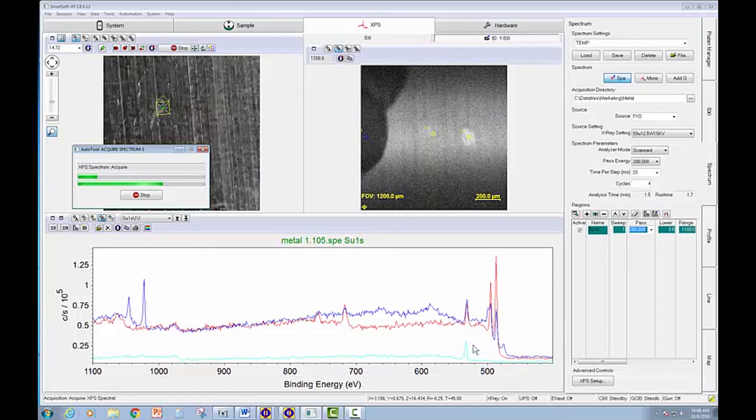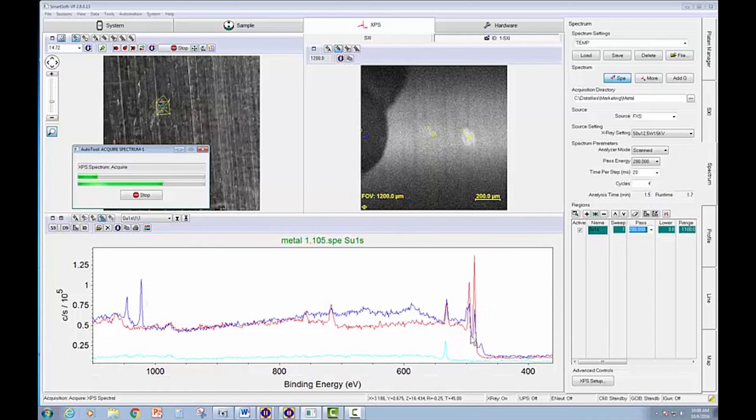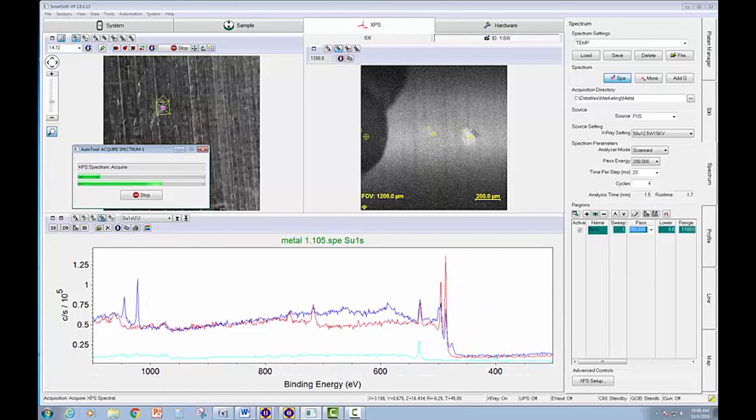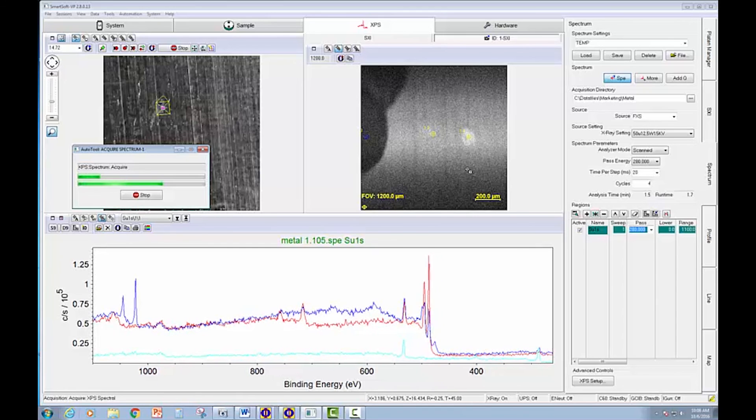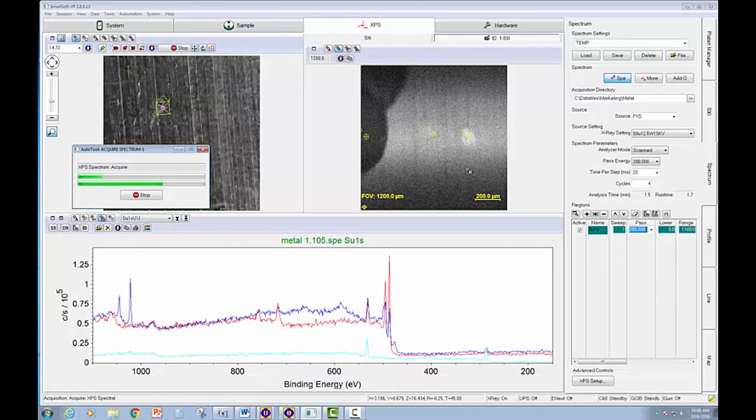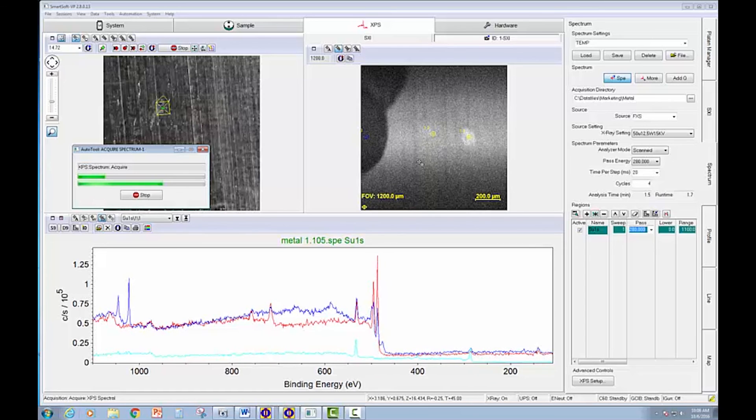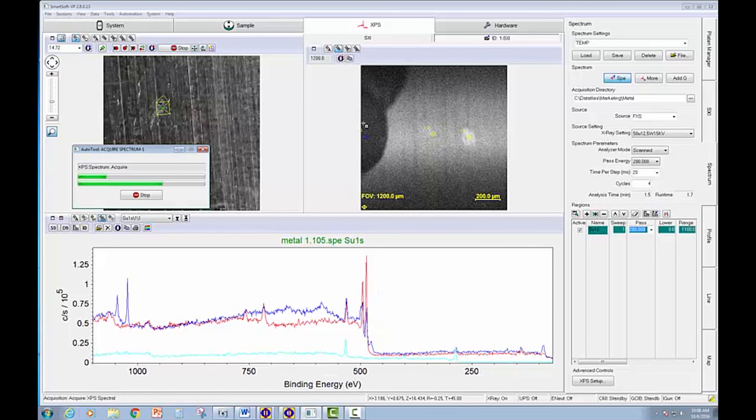We're seeing a fairly large amount of tin in this bright spot. And I believe tin is below the zinc. So we're seeing quite a bit more tin in this bright area. Zinc here. And really no metal in this dark area at all.